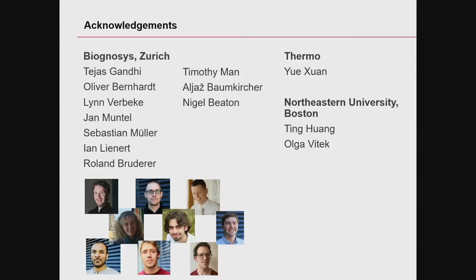Would you have an idea on how Spectronaut performs when it comes to PTMs, and especially to localization confidence, or whatever extra step you would have? Yeah, it was not really a topic of my talk, but in Spectronaut there is no specific scoring for PTMs implemented at the moment. It's something we want to work on actually.